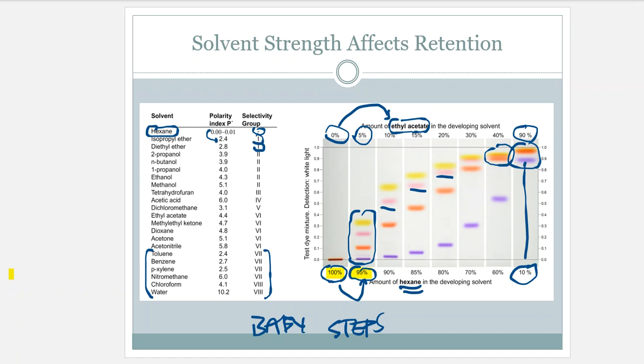All right, guys, so this is one of our last videos before probably the next Canvas assignment is coming up. And we just talked about a couple of different definitions. Some of these definitions were called saturation. One was preconditioning, one was evaporation, and the other one was the formation of a secondary front.